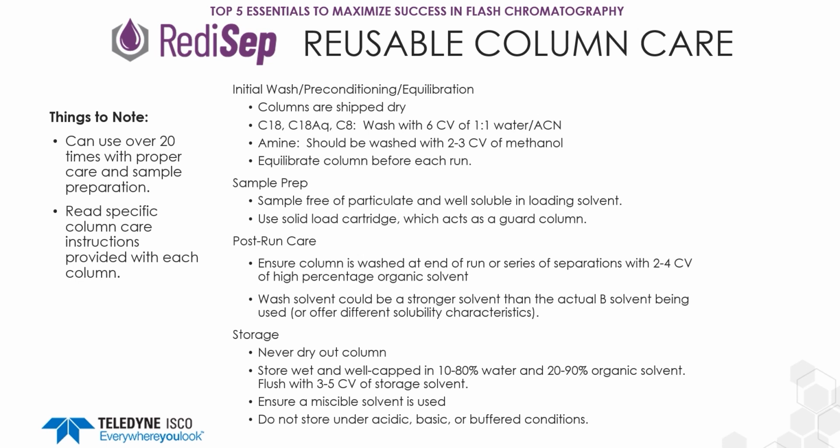And if you're using any sort of modifiers in your solvent system, make sure that you wash those out, because we don't want to store those under basic, acidic, or any sort of buffered conditions.